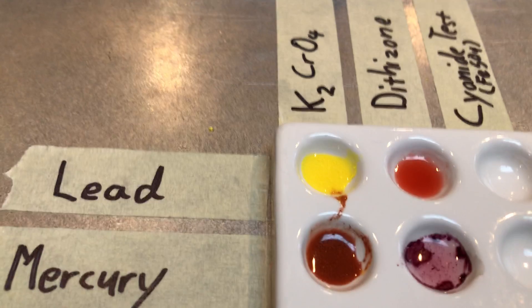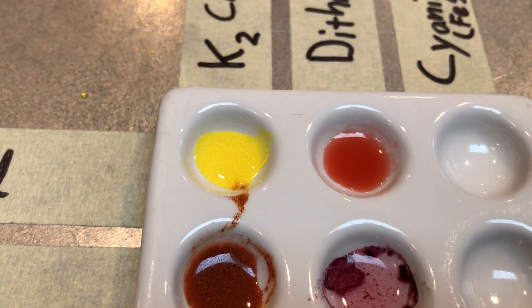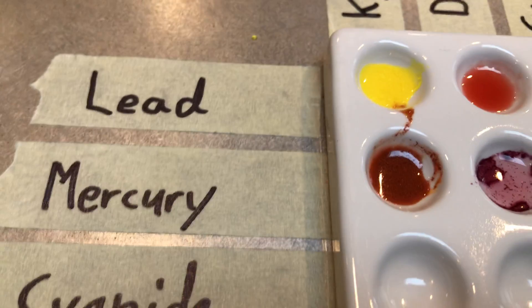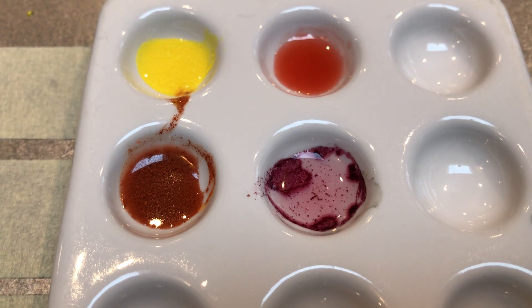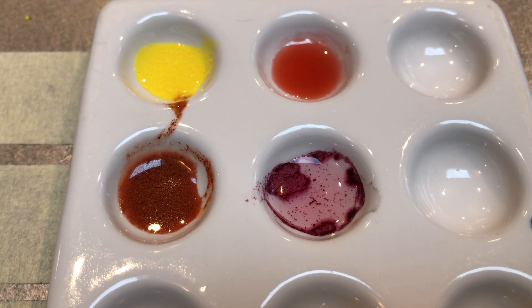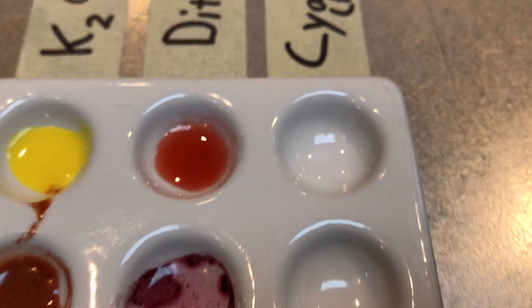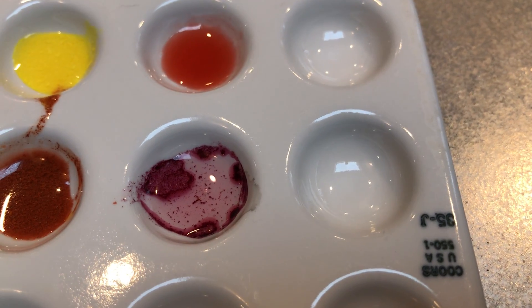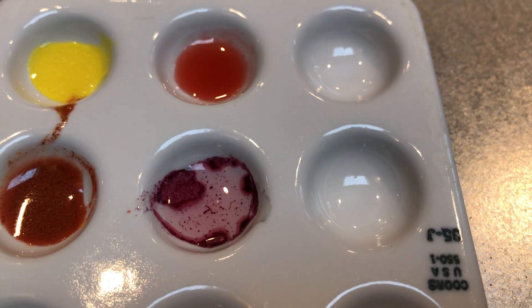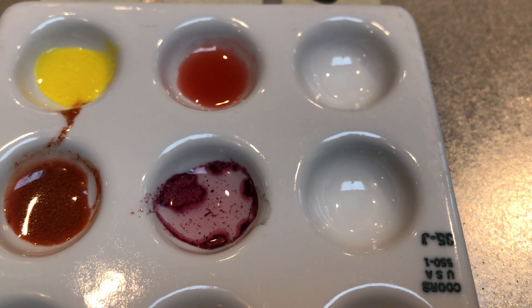So let's look at our results. Lead's reaction with potassium chromate turns a bright yellow color with a precipitate. Mercury's reaction with potassium chromate turns kind of an orange or burnt orange color with a precipitate. Lead's reaction with dithizone just kind of turns a light orange color. And mercury's reaction with dithizone turns a dark purple color with a precipitate. Now we're going to stop the video there and then get set up for our cyanide test.